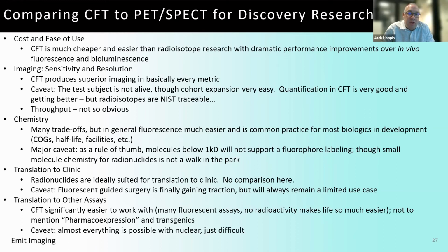In terms of translation to other assays, CFT is so much easier for downstream work, to move to microscopy. Once you have radioactive tissue, it makes life very difficult on a lot of levels. You can let it decay and move on, but the fact that you can have the fluorophore in the test subject and then study this in other modalities is great.